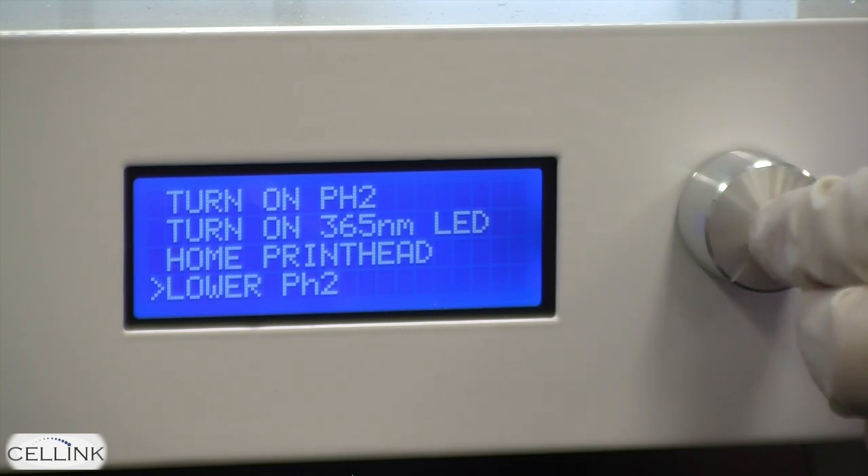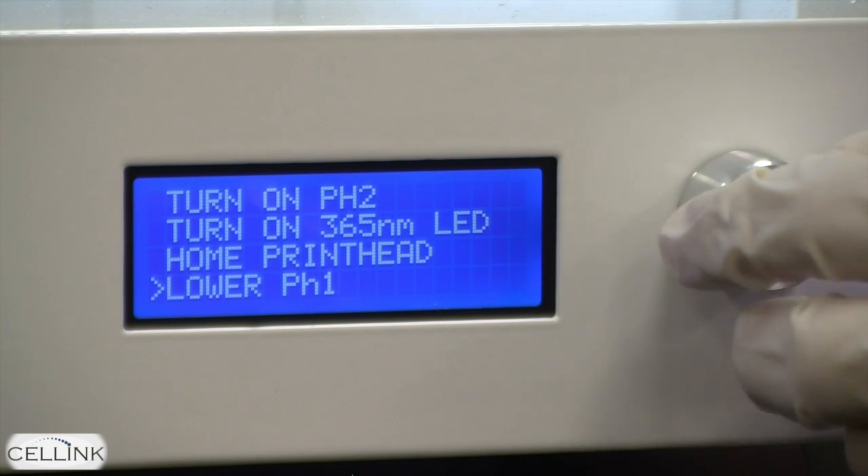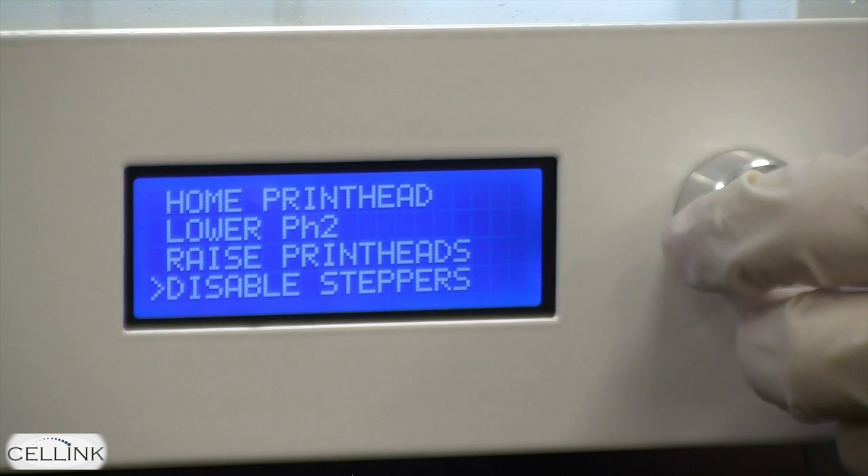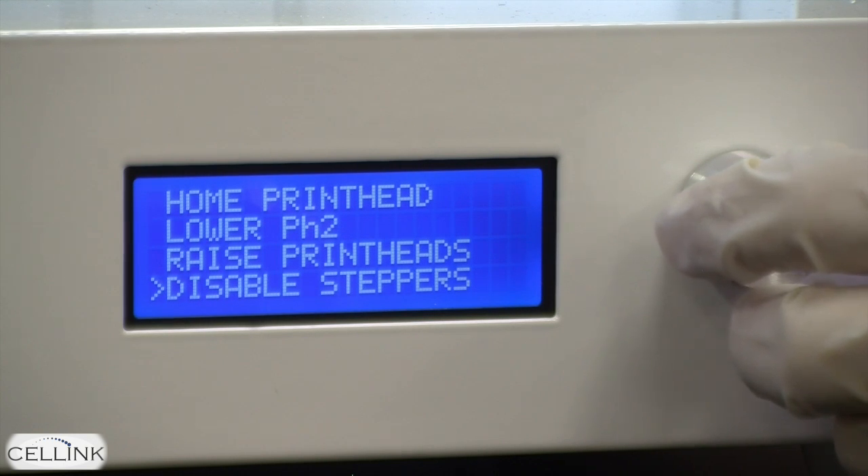The home printhead and the lower printhead 2 functions allow you to adjust the position of each printhead within the bioprinter. The utilities menu also includes the ability to disable the steppers.